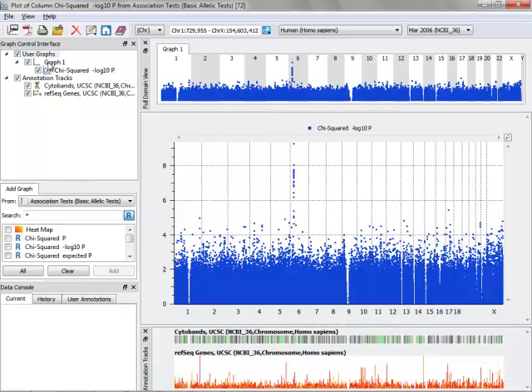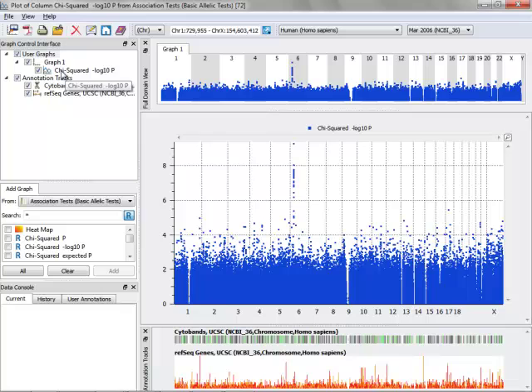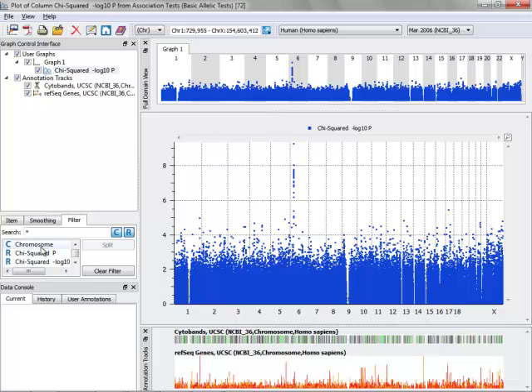click on the graph item, chi-squared negative log 10p. Choose the Filter tab, select Chromosome, and choose Split. This will then go ahead and split that negative log 10p column into individual items, one for each chromosome, where each item is colored differently.